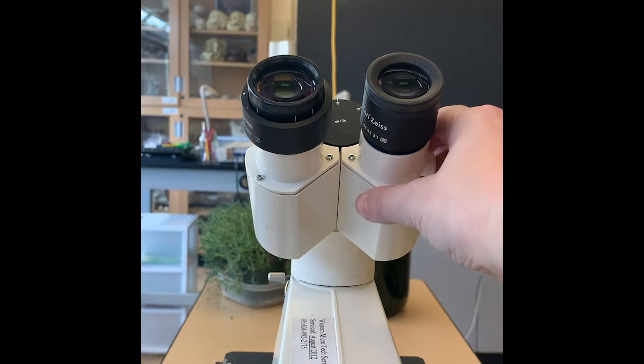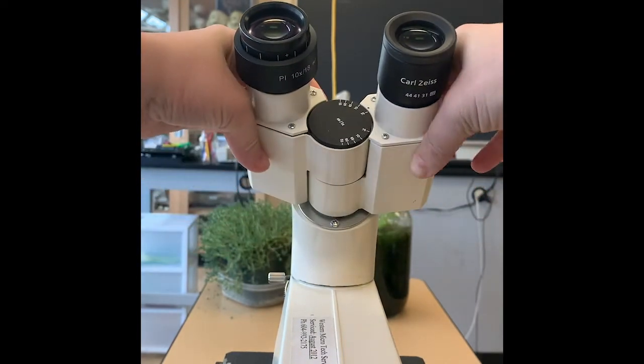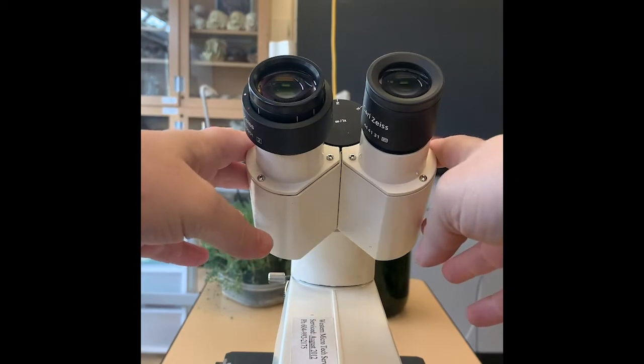When you first go to use the microscope, you will usually adjust these oculars so that when you look through them, you just see one circle of light.